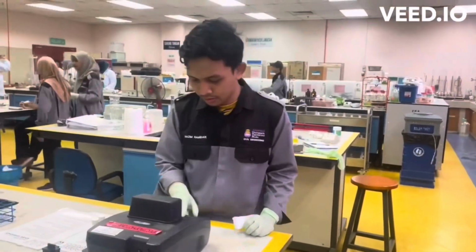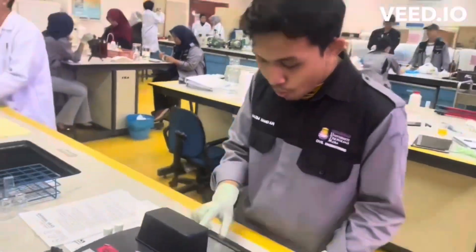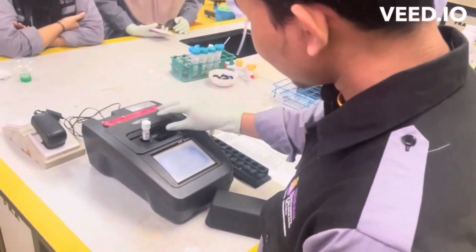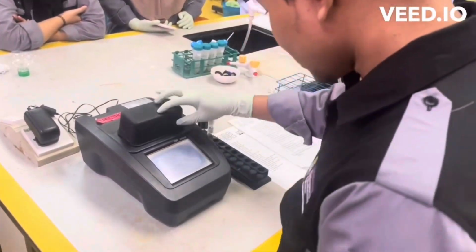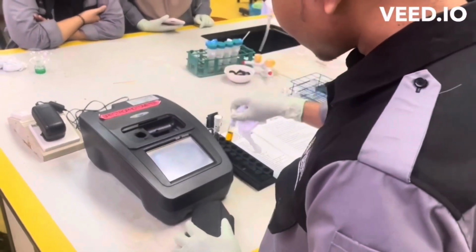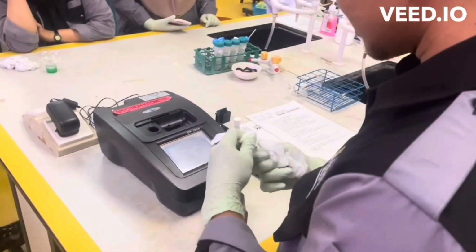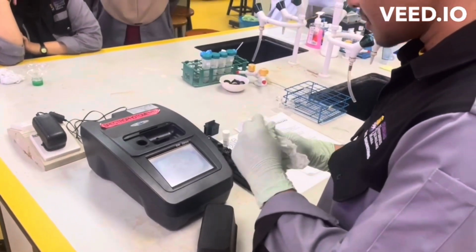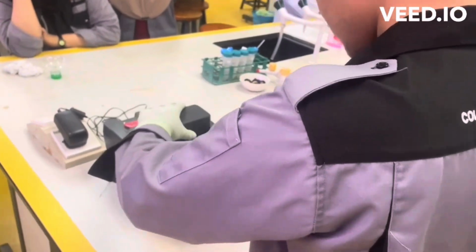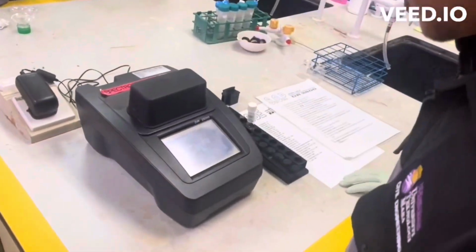Turn on the spectrophotometer, press select by number and press start. Wipe the vial and put it in the cell holder. Press 0. The display will show you 0 reading. Again, wipe the vial and insert it into the cell holder. Press read and the result will display in milligram per liter for COD.